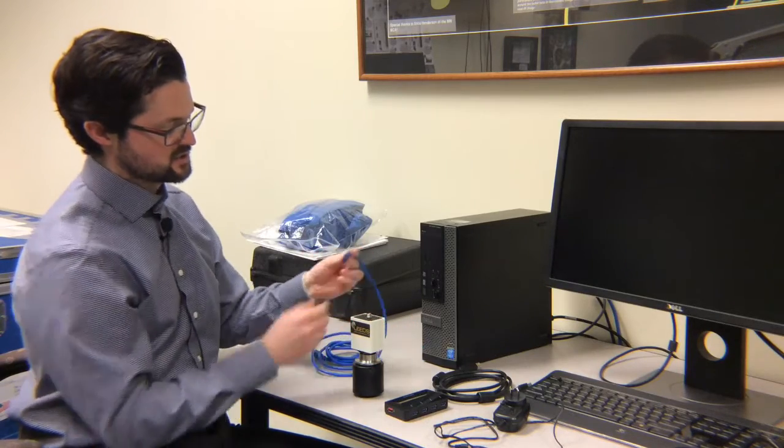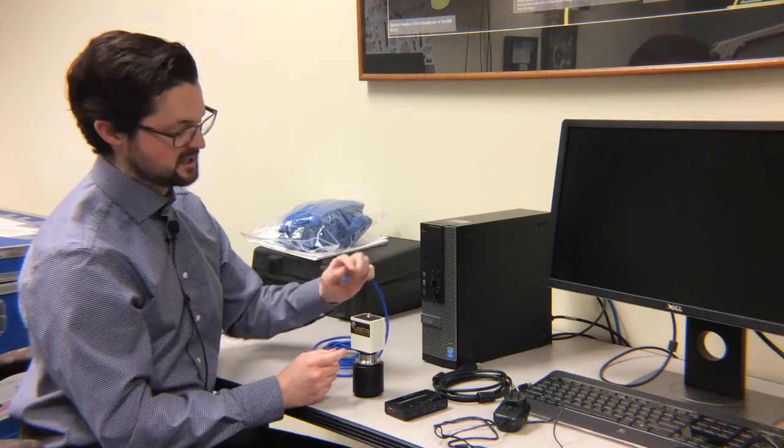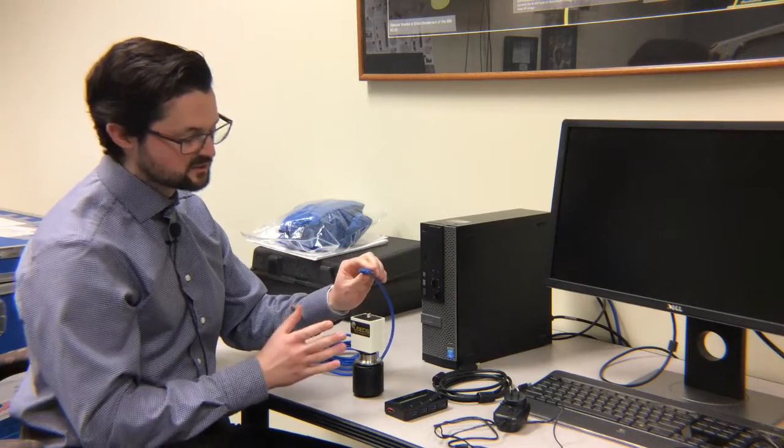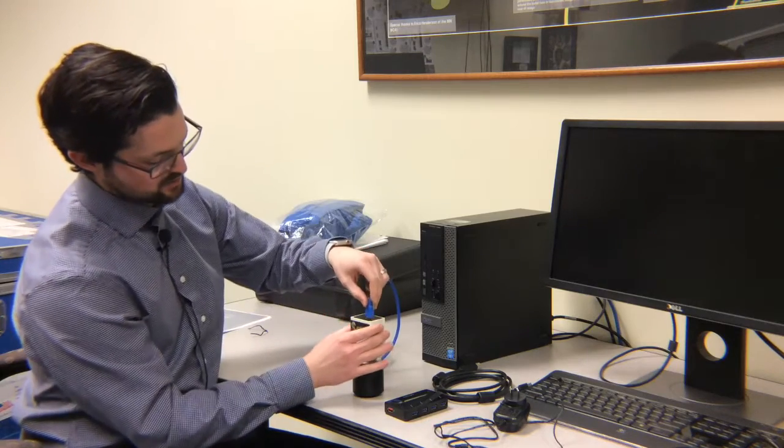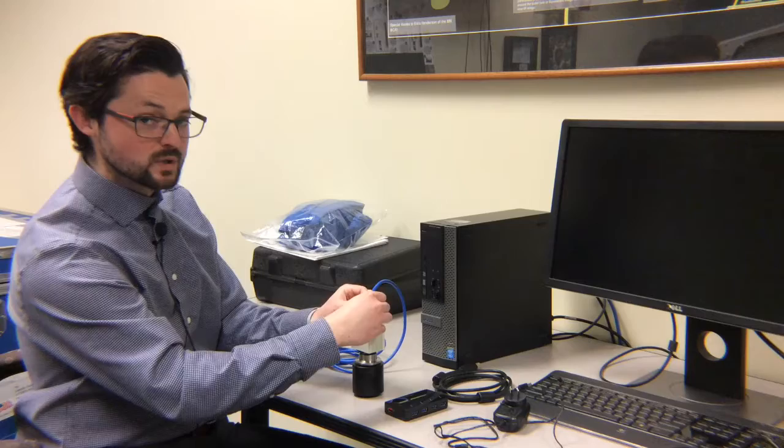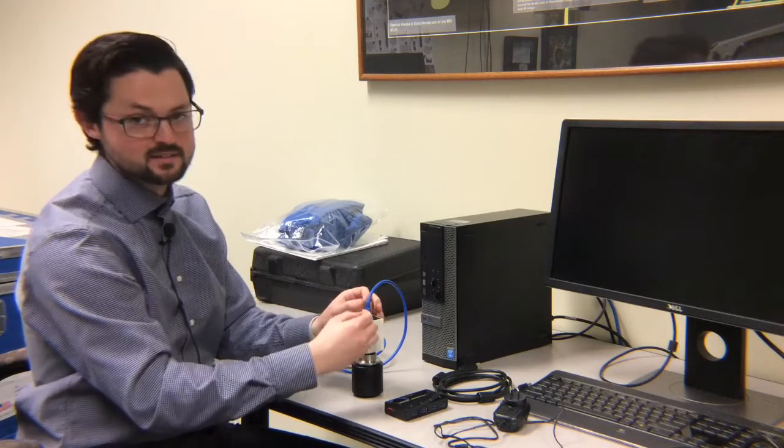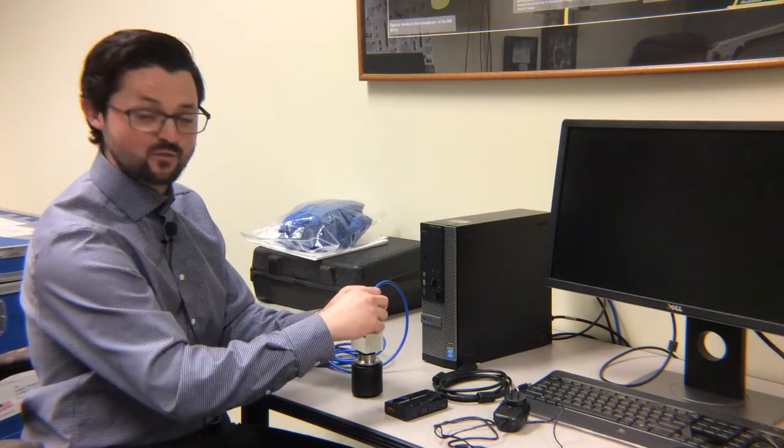Next thing to do is attach the USB cable to the camera. You'll notice it's got a different looking USB attachment cable with two thumb screws on the side. So you just plug it in, and it can only plug in one way. So if it's not going in, flip it. Don't force it.